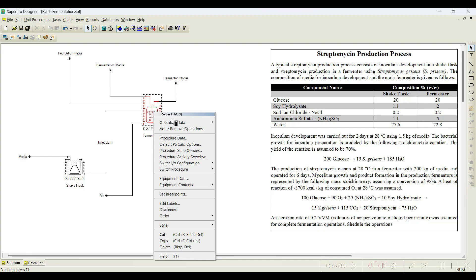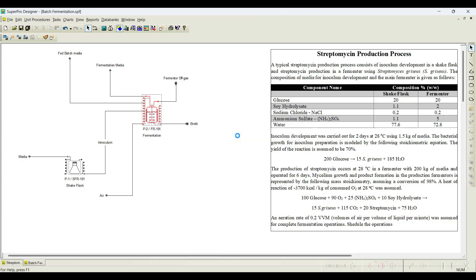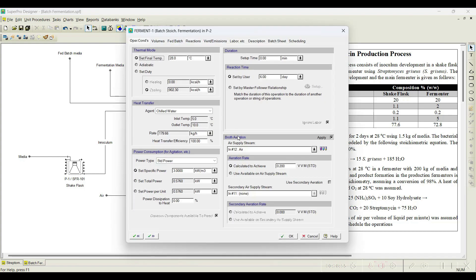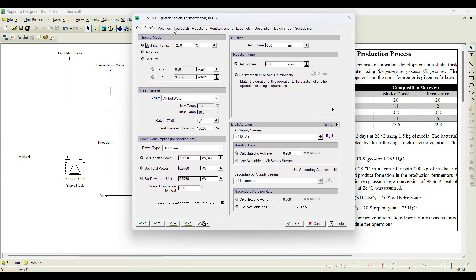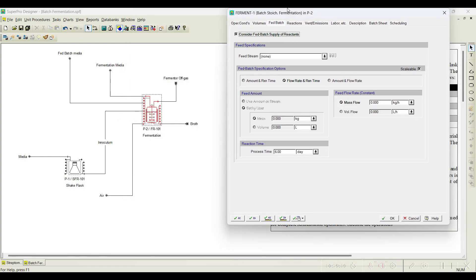Let us see how to initiate this. We go back — the rest always remains the same. We go to this ferment operation, and here there is a tab called 'fed batch'. We click this fed-batch — as of now it is deactivated. I will initiate this, and we also consider how we transfer this fed-batch media, at what rate, and for how long we transfer this fed-batch media.